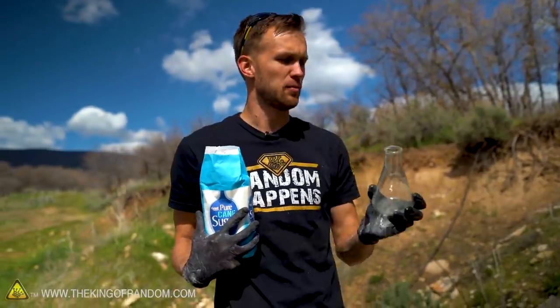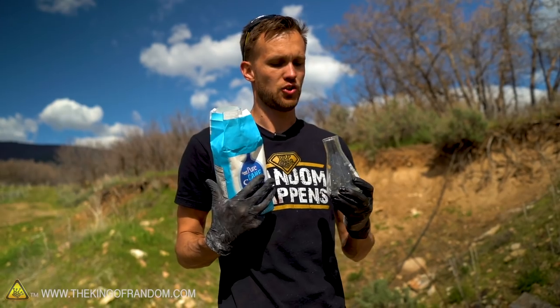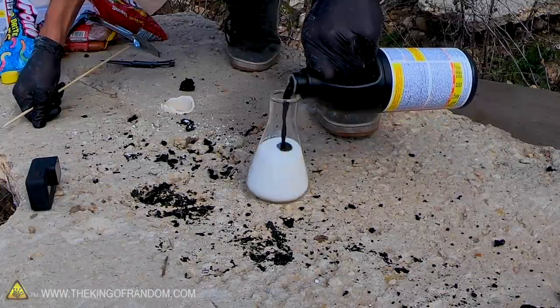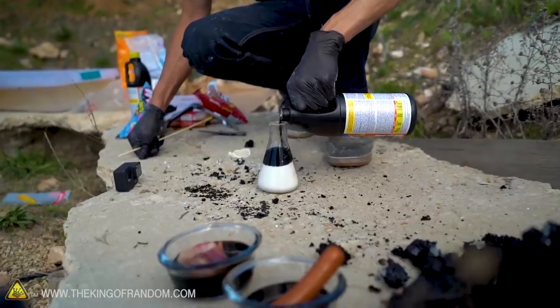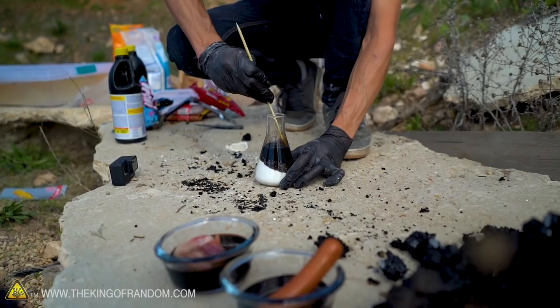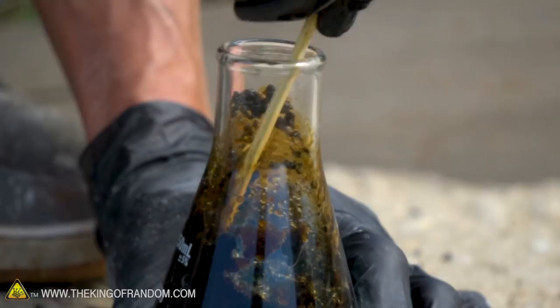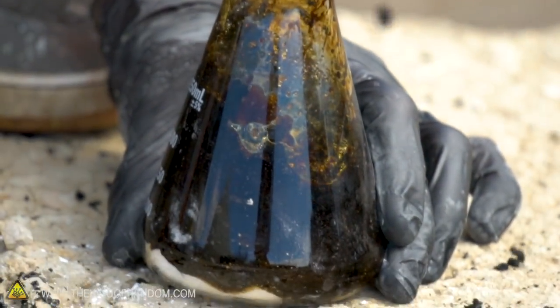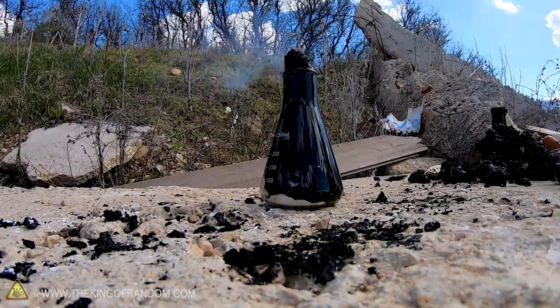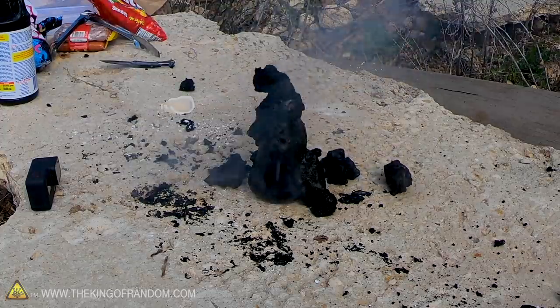We've got another tapered flask, but this time I'm going to use granulated sugar. It will go slower, but that's actually something I want — it should give me time to stir and mix everything together better than I was able to with the powdered sugar. Demon elephant toothpaste!